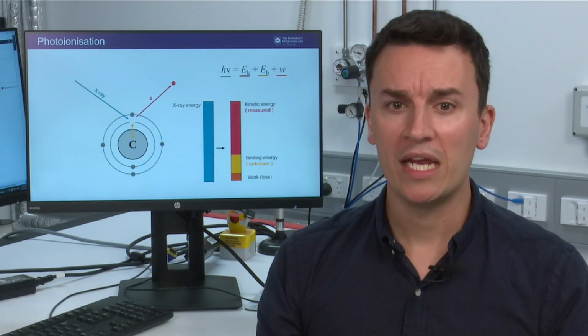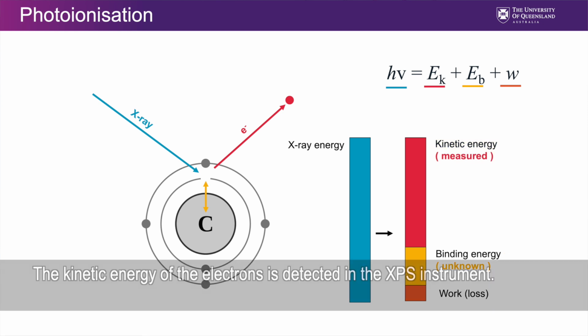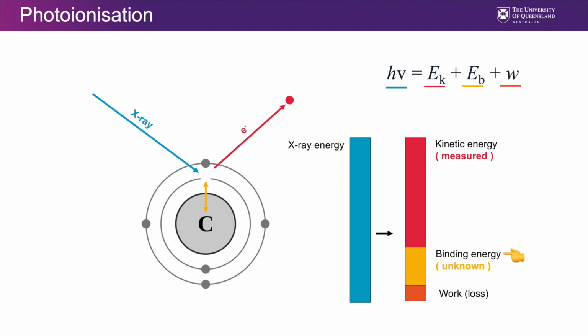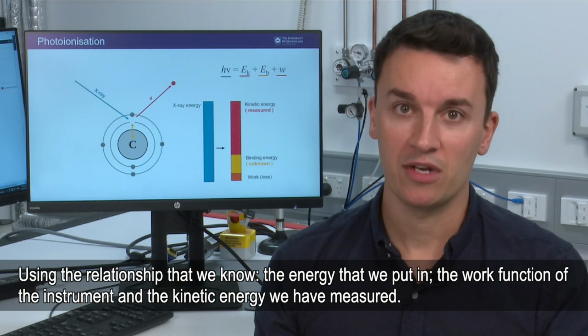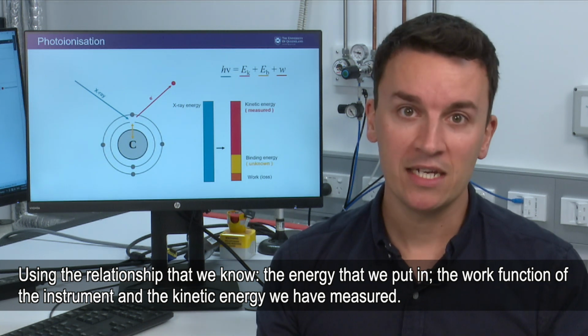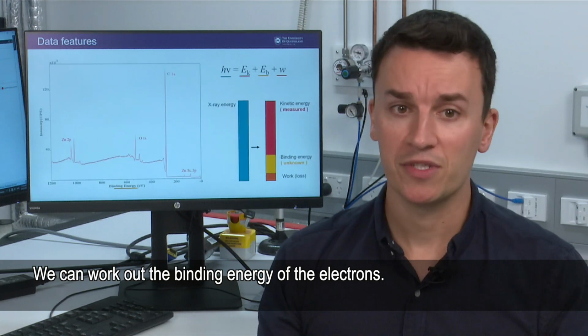With XPS, we measure the kinetic energy, but we report the binding energy. The kinetic energy of the electrons is detected in the instrument, and the binding energy is what is unknown. But using the relationship, we know the energy that we put in, we know the work function of the instrument, and we know the kinetic energy because we've just measured it, so we can then work out the binding energy of the electrons.